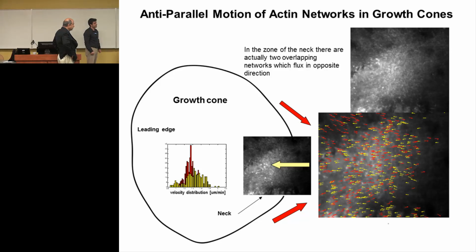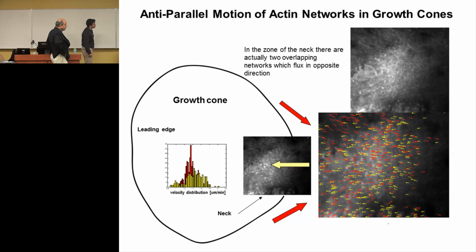So another question is, when you're doing this sort of imaging, in both the cell tracking as well as the tracking of the cancer cells in blood, for lack of a better word, is it like a moving sensor, or is the actual physical object moving with respect to the sensor or the microscope? I mean, the cells are obviously moving. Yes. So you have a cell. Is that moving?